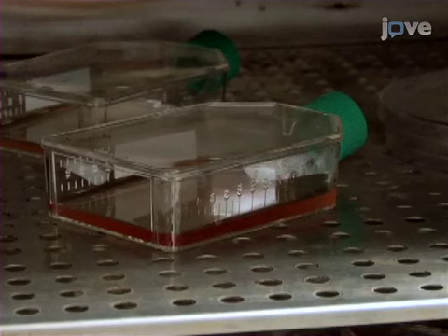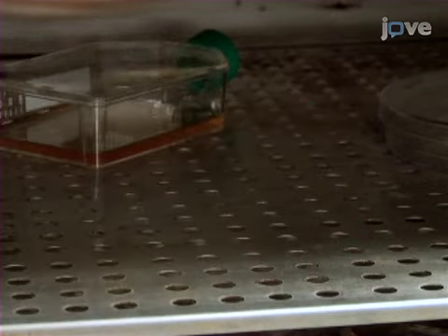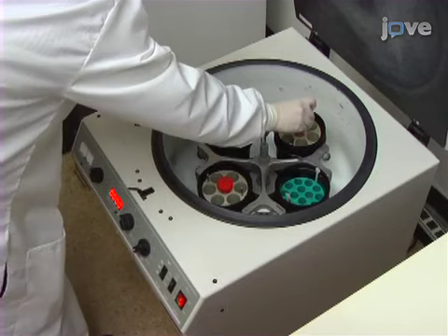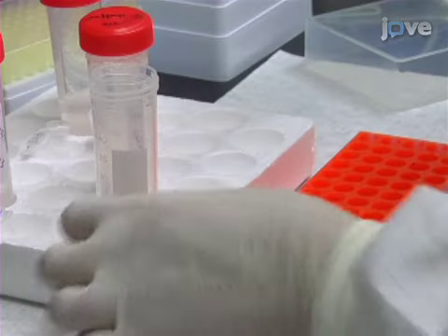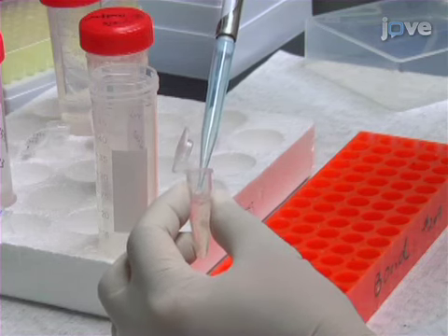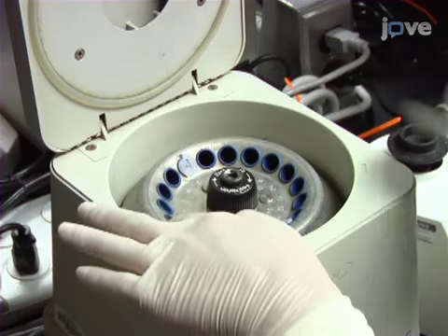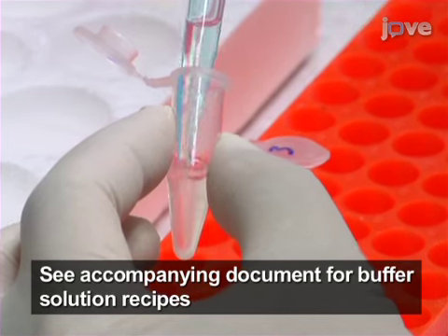Grow Jurkat cells in RPMI 1640 medium containing 10% FBS at 37 degrees Celsius in a T75 tissue culture flask. Pellet cells by centrifugation at 1000 times G for 20 minutes at 4 degrees Celsius. Resuspend the cell pellet in 1 milliliter of PBS and transfer it to a 1.5 milliliter microcentrifuge tube. Spin at 1000 times G for 1 minute. Then, resuspend the pellet in 1 milliliter of anti-FLAG lysis buffer by gentle pipetting.